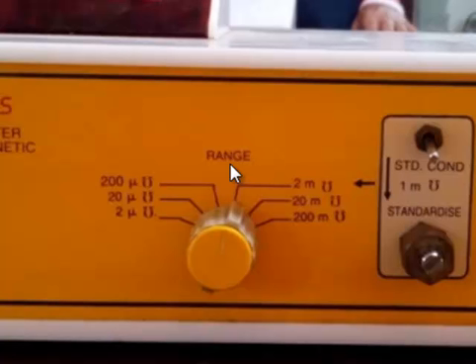So in case your solutions have very poor conductance, then the readings can be taken in micromhos or microsiemens range. In that case, this particular knob can be placed in the lower range, and the readings shown on the display will be in microsiemens or micromhos, and hence if you need to represent it in Siemens or mhos, you will need to multiply them by a factor of 10 raised to minus 6.